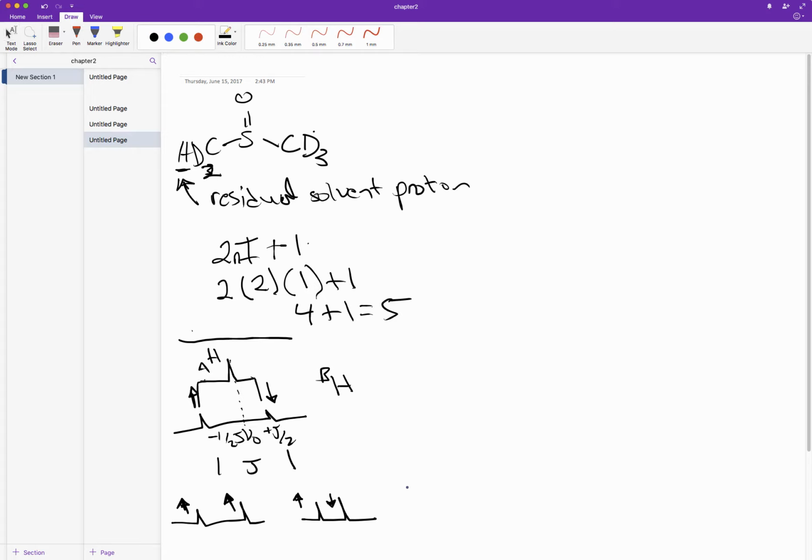Now if we have an HC coupling partner, then this will be up and down, and then up and then down. Oops, I did this totally wrong, didn't I? I screwed up this guy right here. He should be down.